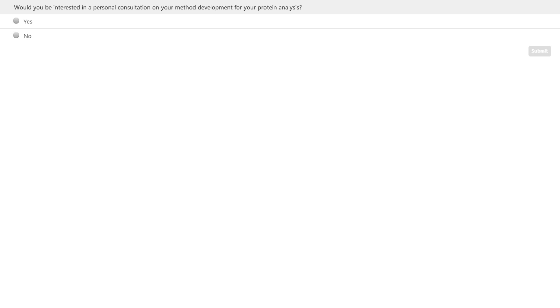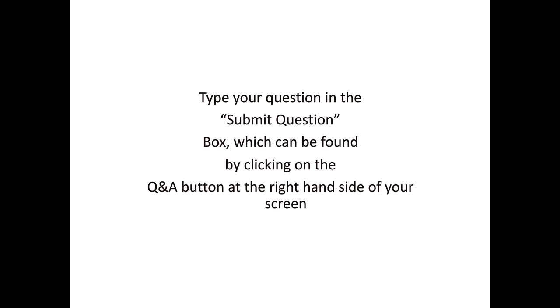All right, we just have a couple minutes, but I think we can get a couple questions from the audience in. So here's the first one. Barry, at 100 degrees C, what protects the protein from being denatured?